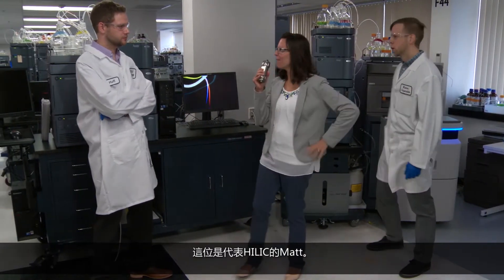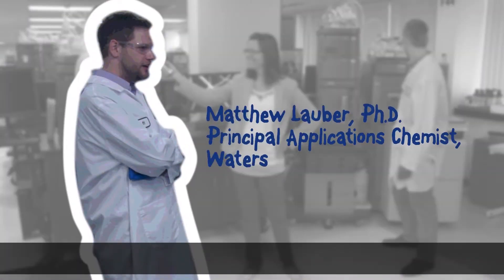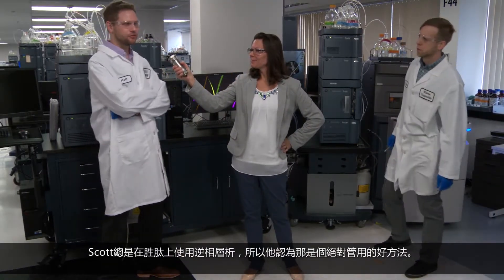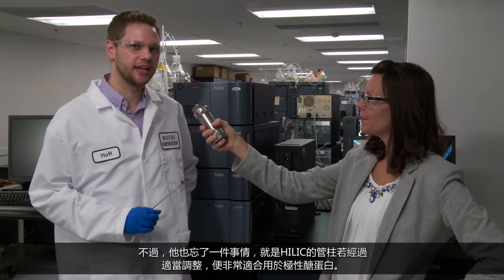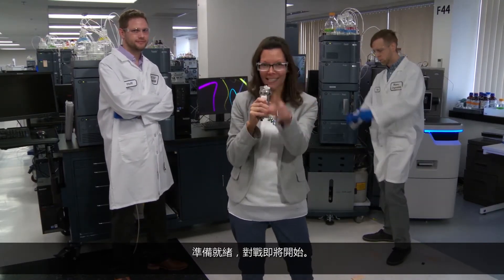And in this corner, we have Matt for HILIC. Thanks Jen. Scott's always running peptides on reverse-phase, thinking it's good enough and it's going to work — and I'm not totally disagreeing. What he's forgetting, though, is that a properly conditioned HILIC column is a great match for polar glycans. Let's get ready to separate.